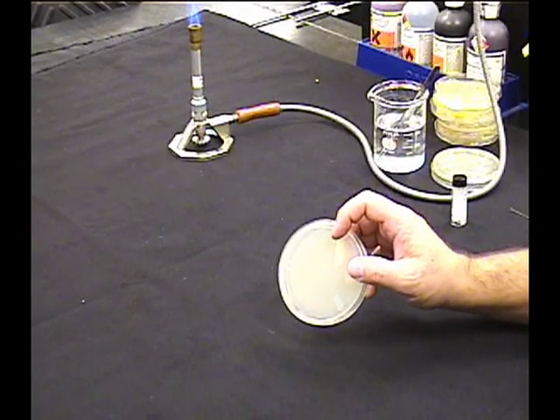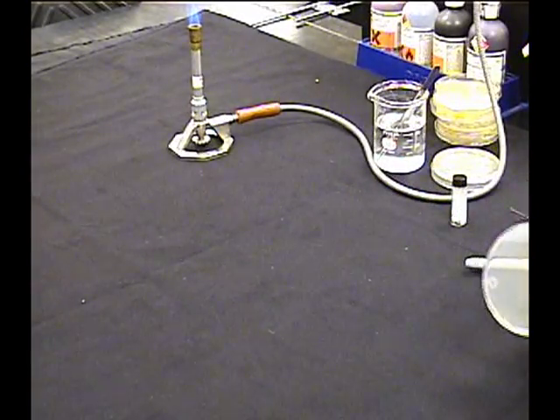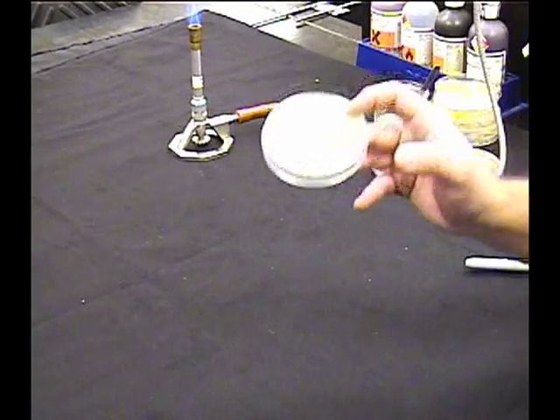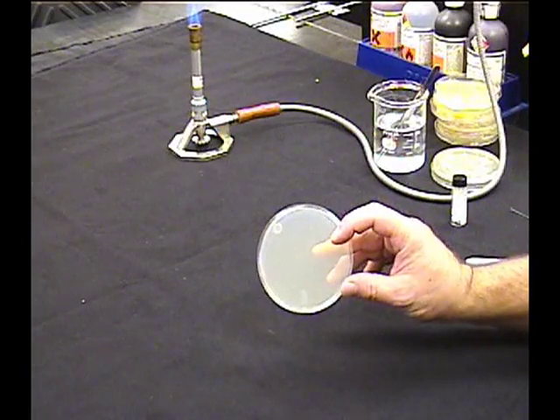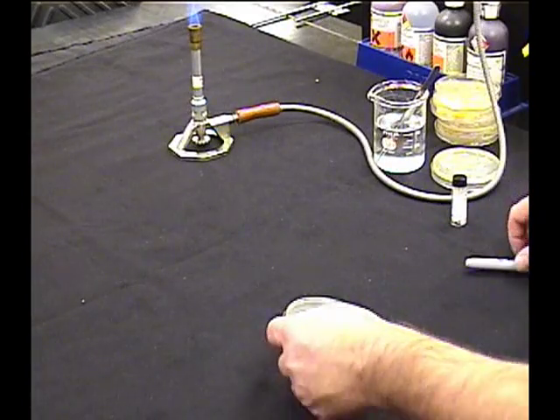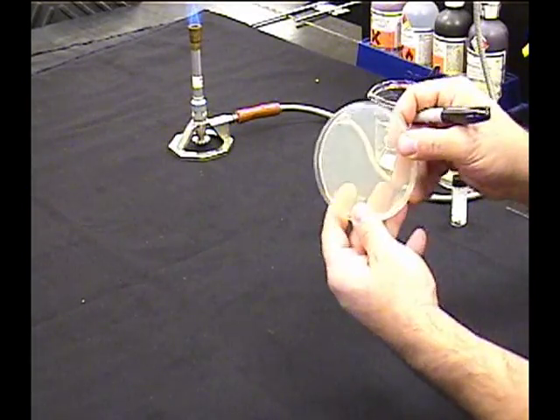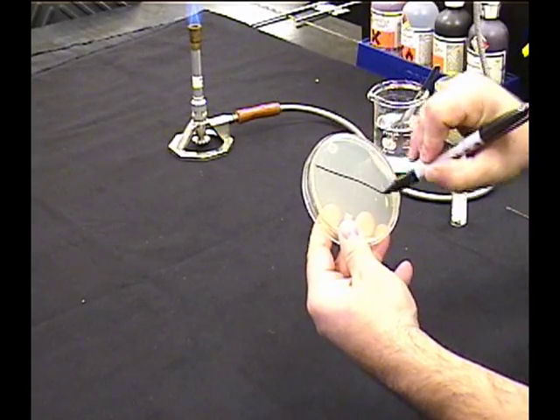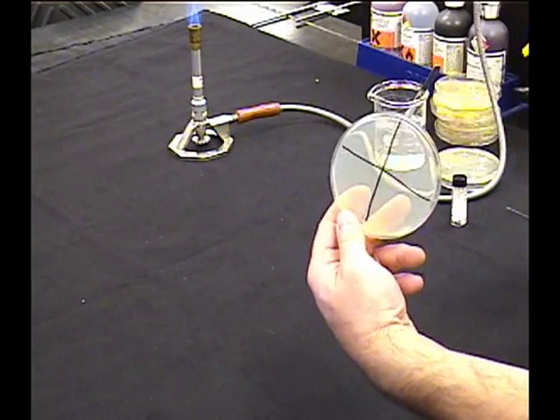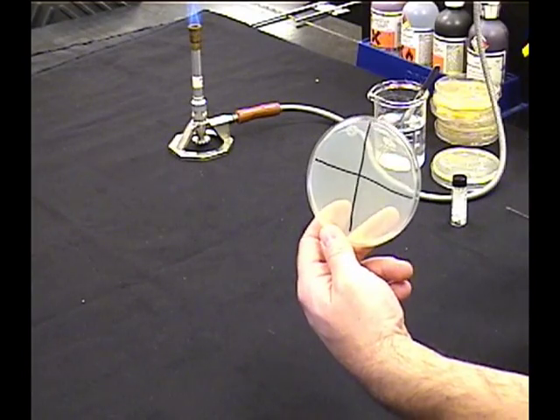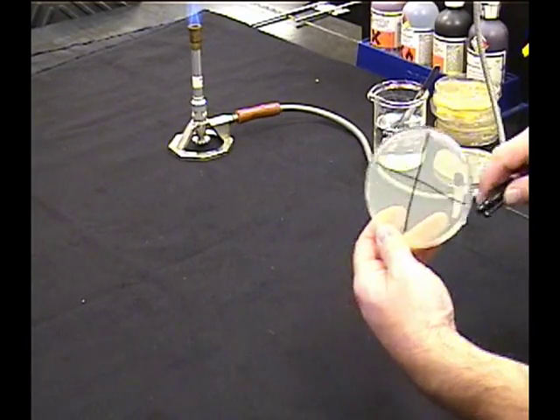In this case, we're going to test it. In order to test it, first of all, we need a TSA plate, just like we had before. But what we're going to do this time is divide it into quadrants. We're going to divide it into four. Just take a sharpie, draw an X on the bottom. Makes life easy.